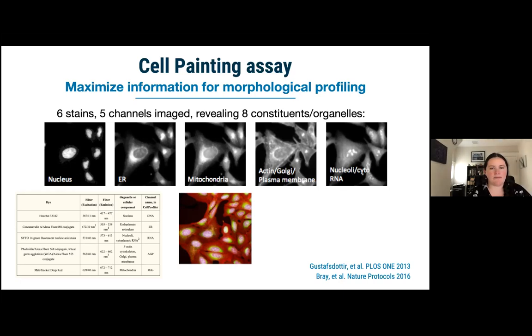Yeah, the scaling 0 to 1 is in fact how most of the things I'm aware of that calculate texture features in this way start, by scaling the image 0 to 1, and usually going further and scaling the image into a number of discrete bins. The original paper said we're going to take the image and bin it into 8 bins. So it doesn't really matter that things are scaled 0 to 1, because the relative differences, whether you're talking about 0 to 1 or 1 to 65535, are always going to be the same if you've done your scaling properly.